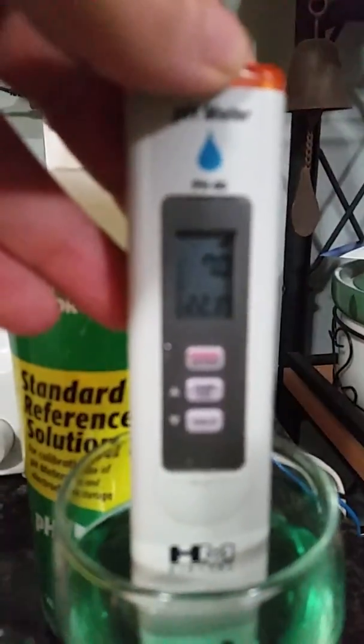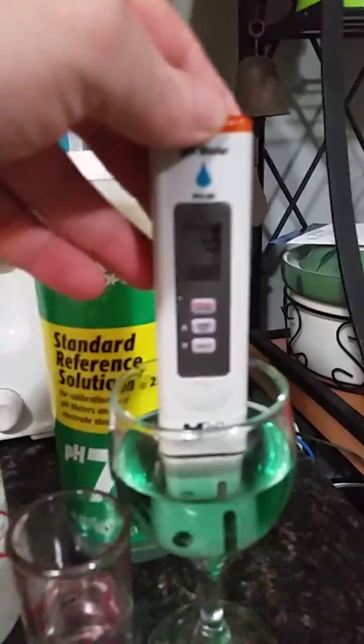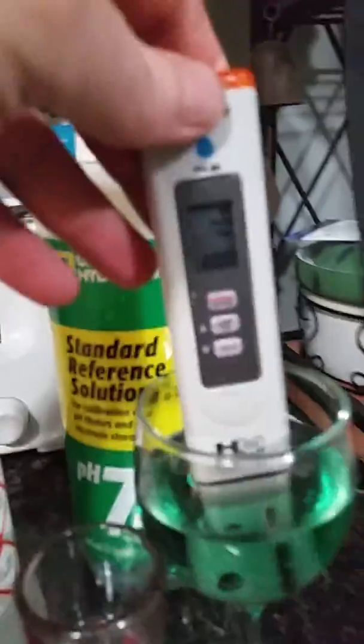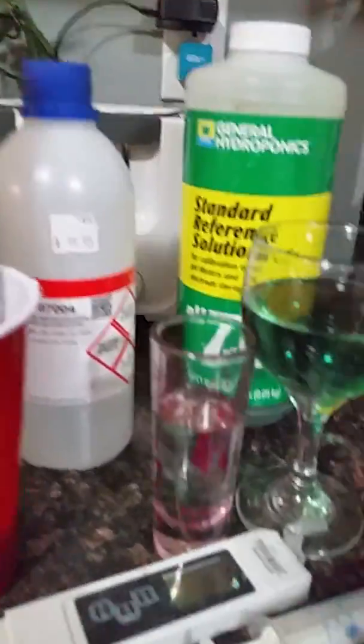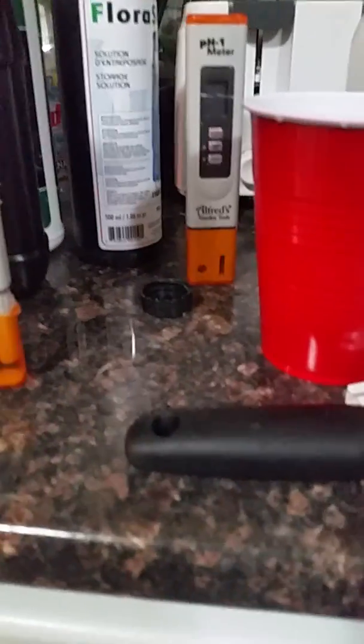Drop them in either the seven or four solution and make sure it comes exactly back to it. If he's not exactly back — if it's 7.1, it's not right; 6.9, it's not right. Something's not right, do it again. Check your temperatures and recalibrate. Every time you use your pen, recalibrate — it doesn't cost a whole lot. You won't have to use it a lot once you get used to how many drops you're putting in. Your water is pretty much the same most of the year.